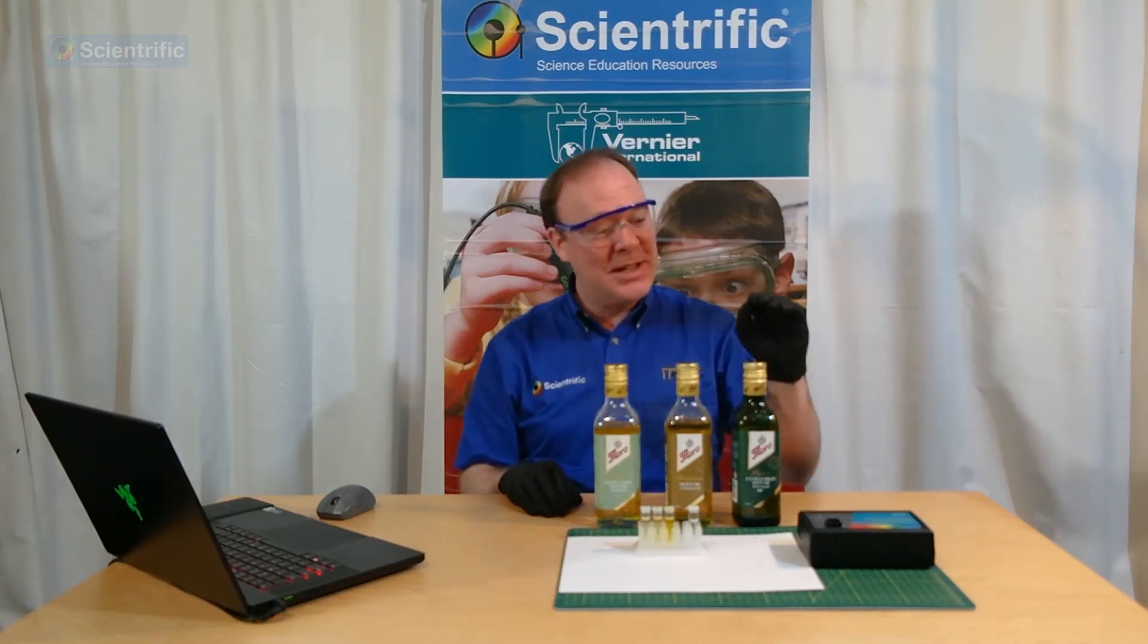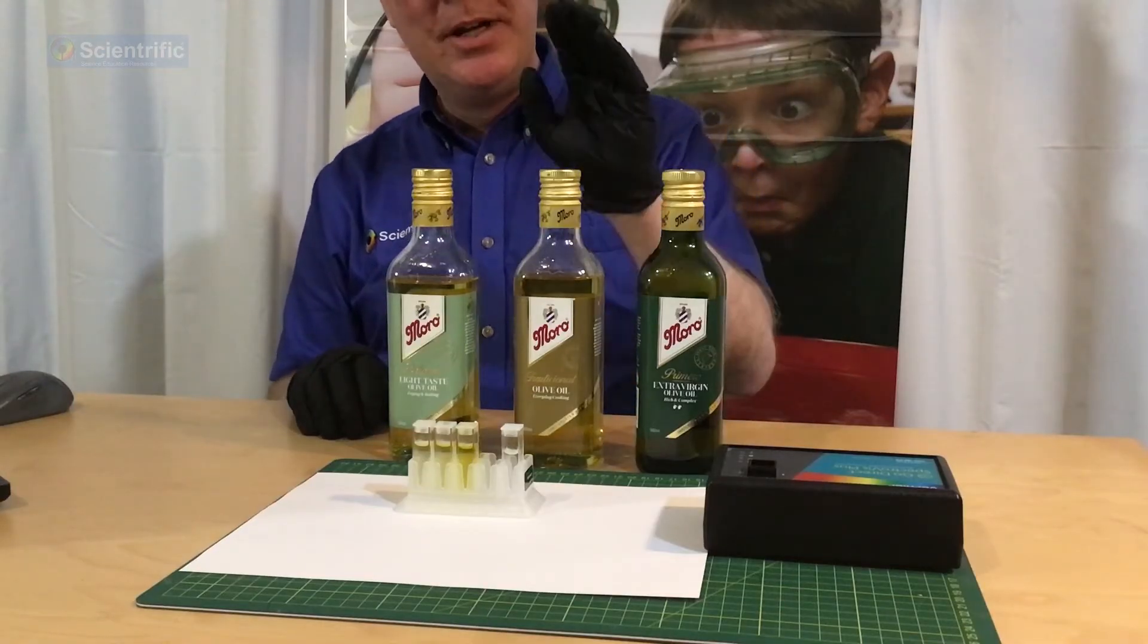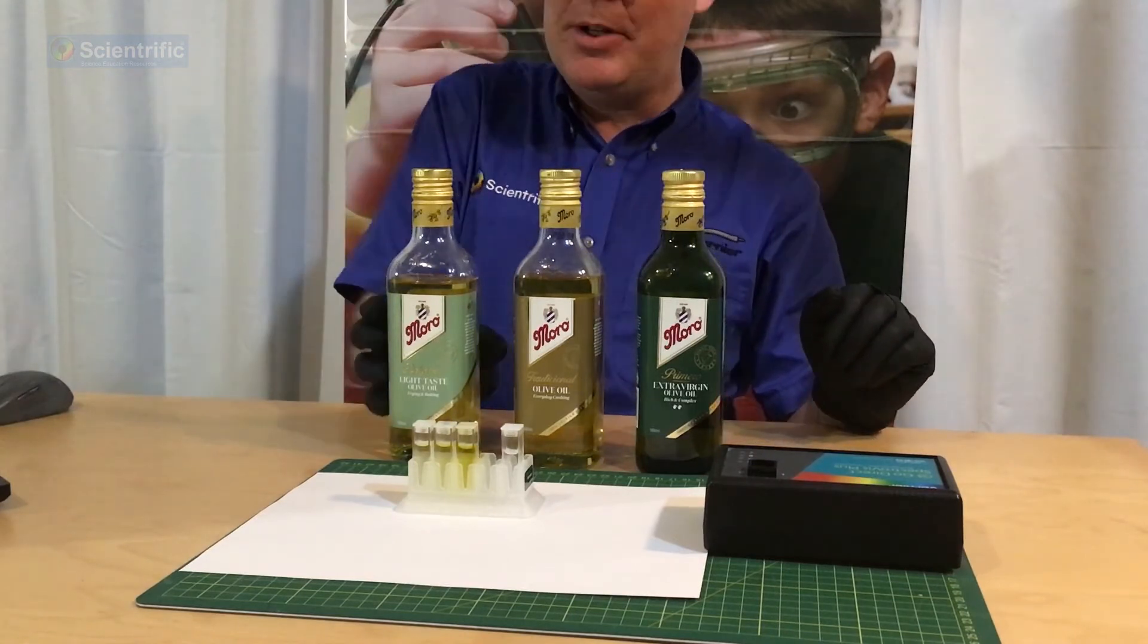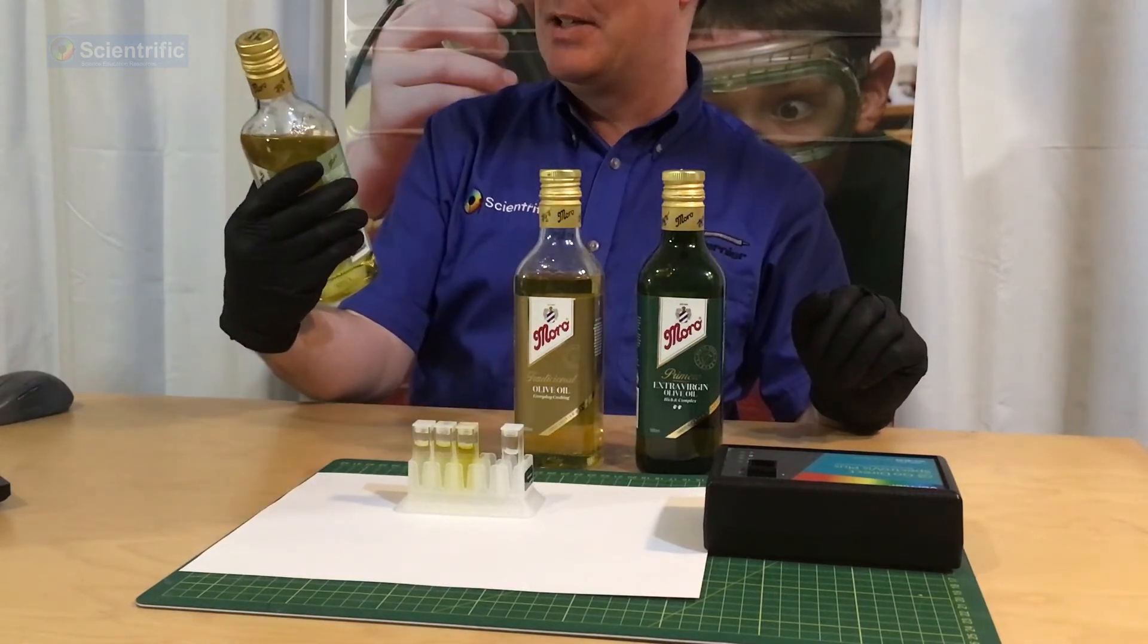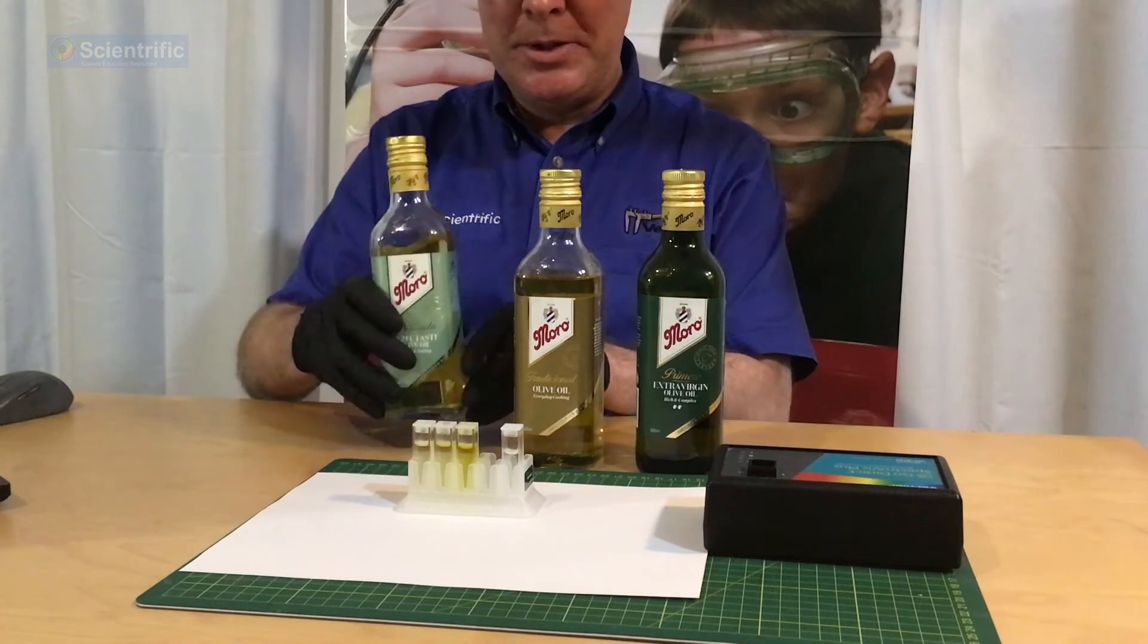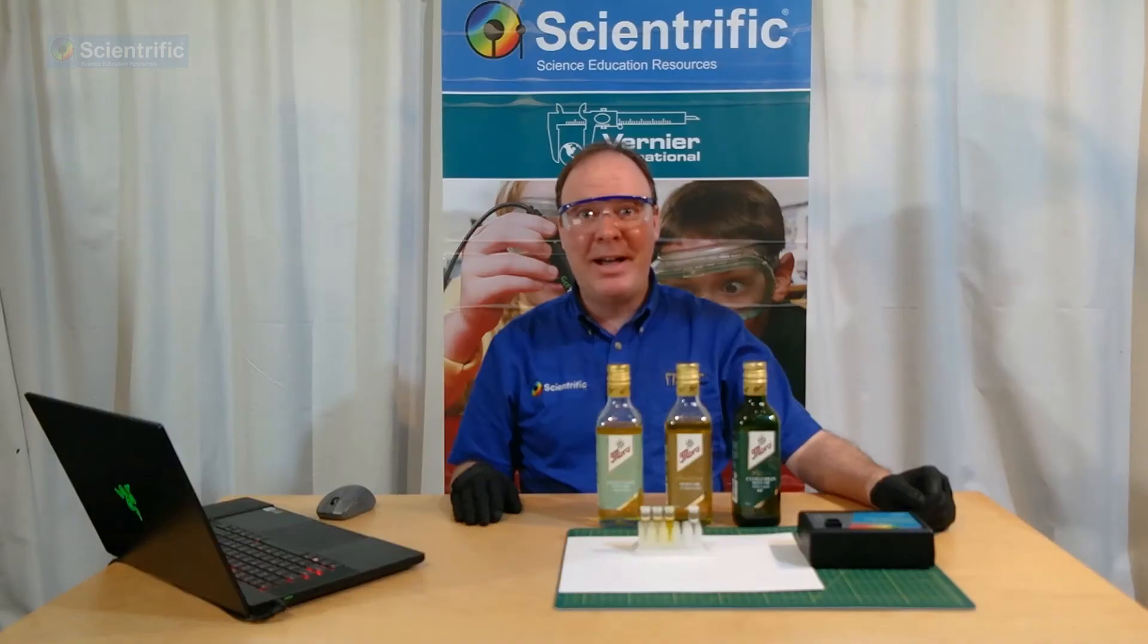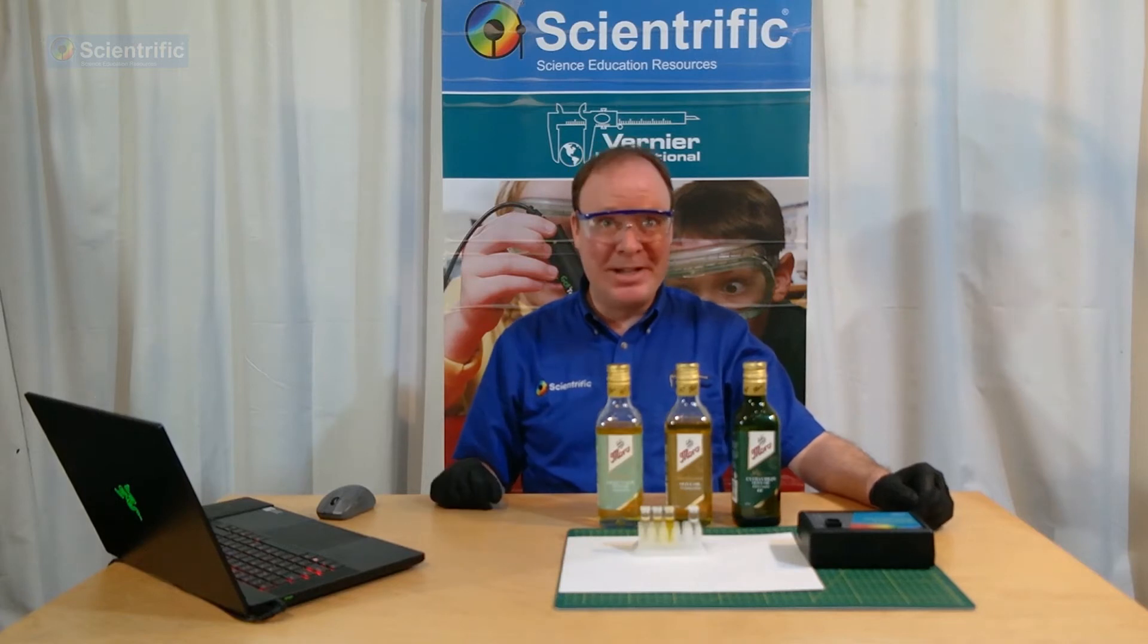I have three different grades: extra virgin olive oil, standard olive oil, and light taste olive oil. I have Spectral Analysis ready to go, so let's get into it.